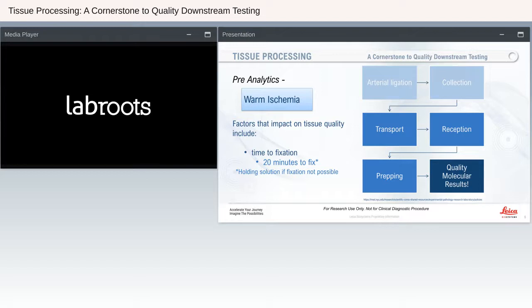If you need to, keeping tissues near 4 degrees Celsius prior to fixation will slow down some of these processes induced by oxygen and nutrient deprivation. Prior to fixation, tissues should be maintained in a neutral isotonic solution with physiologic calcium and magnesium concentrations to avoid unnecessary disruption of adhesion systems and activation of signaling cascades. An example of that would be PBS plus the calcium and magnesium.